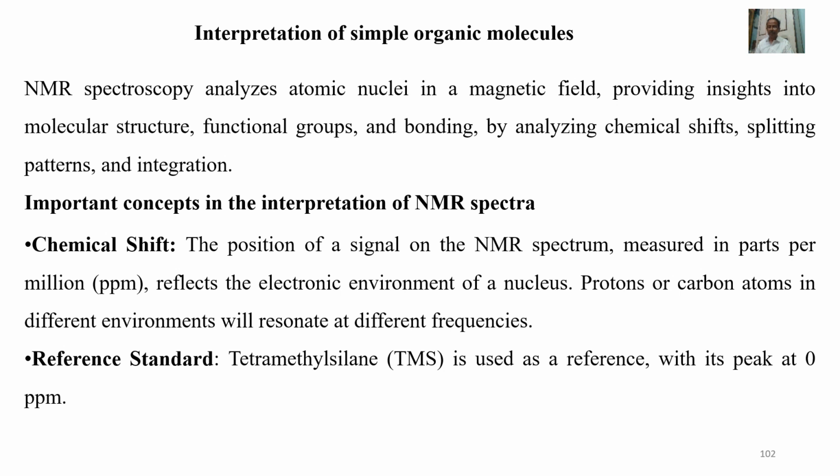NMR spectroscopy is a crucial analytical tool for organic chemists. The research in the organic lab has been significantly improved with the aid of NMR. Not only can it provide information on the structure of the molecule, it can also determine the content and purity of the sample.